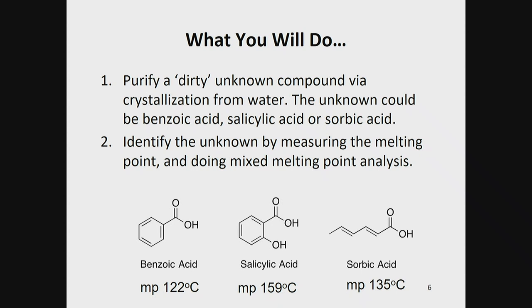So what's the objective of this experiment? It's to purify a dirty unknown via crystallization from water. So I mentioned you'll take a solid, you'll involve some sort of solvent or liquid, and in this experiment, it is water. The unknown dirty compound that you would be issued could be benzoic acid, salicylic acid, or sorbic acid.